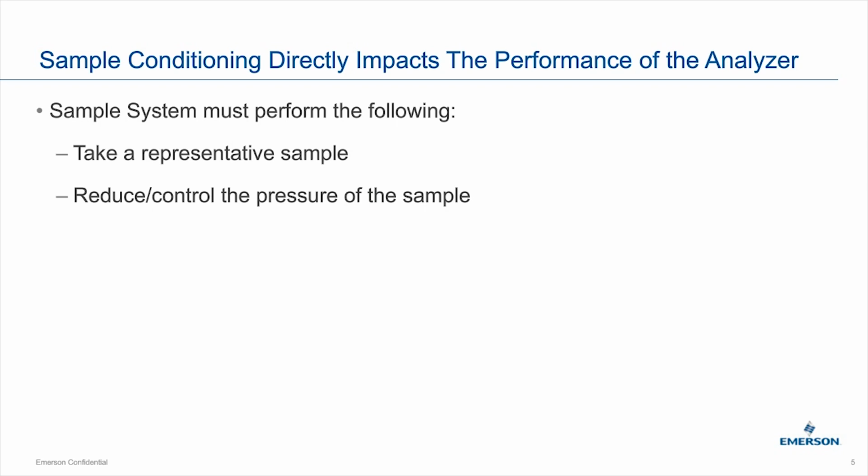And so when we do initial phase diagrams, you may be looking at a nice good area in the vapor phase. Dropping that pressure can result in a drop in temperature, and you can actually go into a 2-phase situation. So it becomes very critical when we're managing the pressure in the sample handling system. It's also important when you have liquids, because a lot of times you may want to maintain that pressure or even increase the pressure to avoid bubbles forming in the liquid.